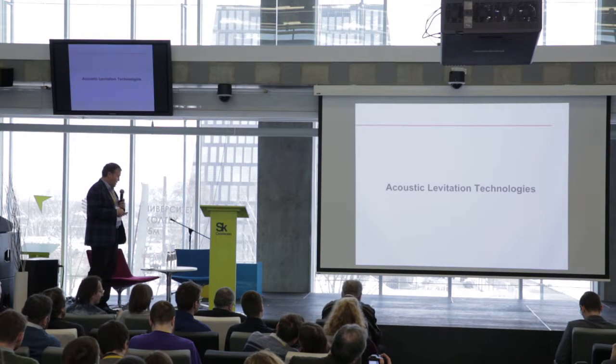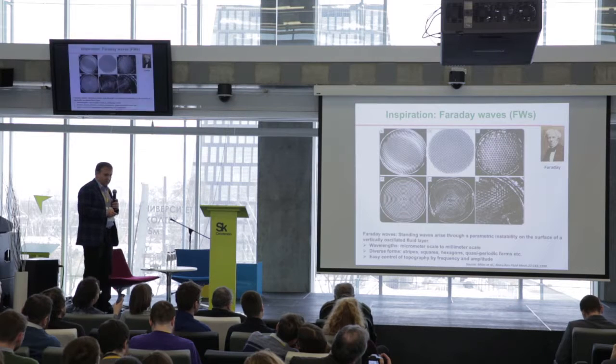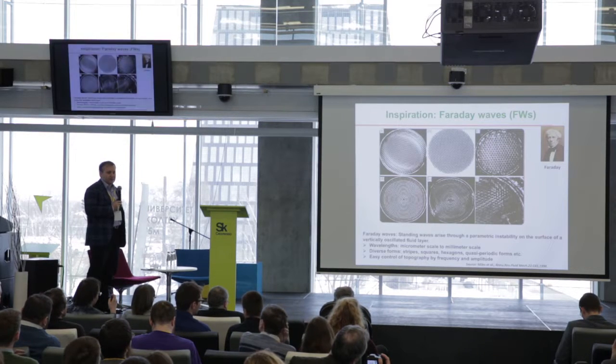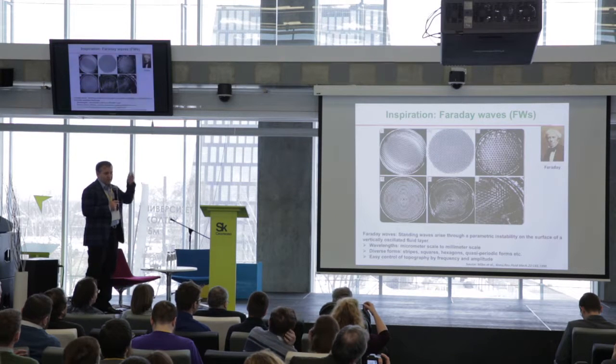The main focus I'll spend time on today is acoustics and how we use acoustics to assemble spheroids and cells in 2D, 3D, and in the Z dimension.